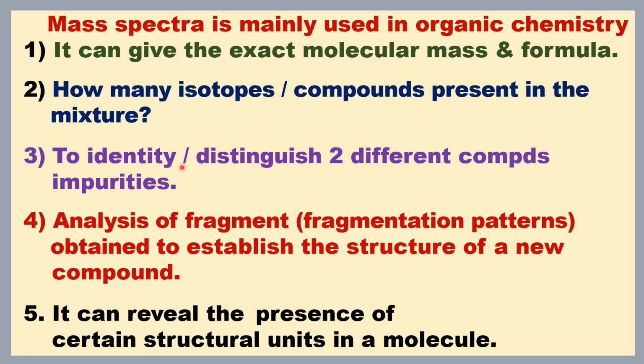It can identify and distinguish two different compounds, and detect impurities. Analysis of the fragmentation pattern, that is, each ion gives specific ions, is used to establish the structure of a new compound. It can also reveal the presence of certain structural functional units present in a molecule.